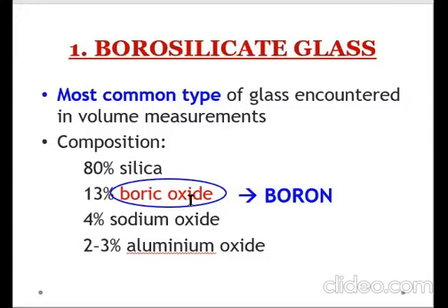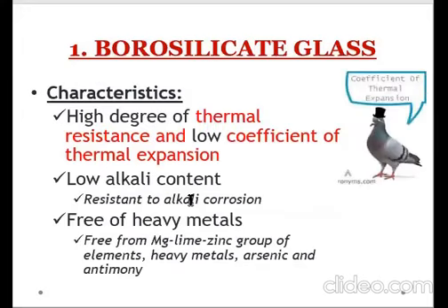Now, if you're going to search on the internet, it is also known as hard glass. So, sir, meron tayong tinatawag na hard glass. Meron din po bang tinatawag na soft glass? Yes, meron din pong soft glass, but later natin siya ma-encounter. Okay? So yun siya. So what are the characteristics of borosilicate glass?